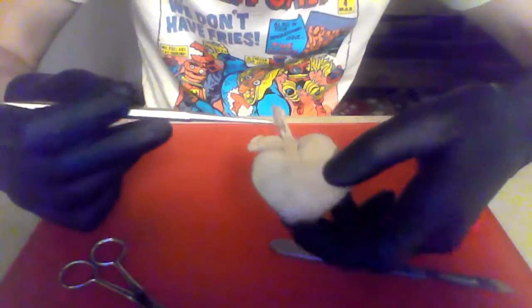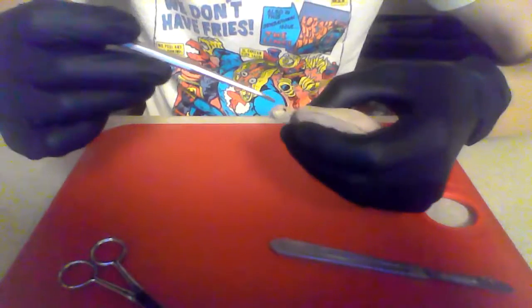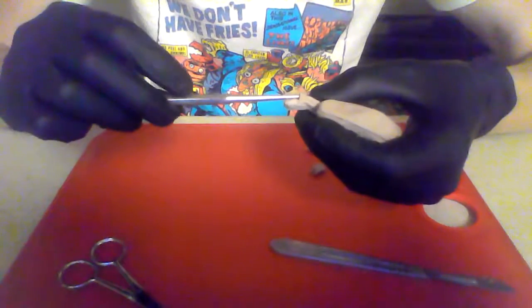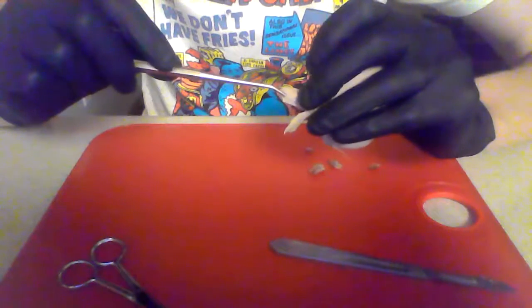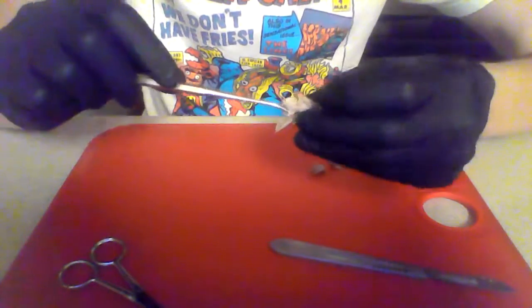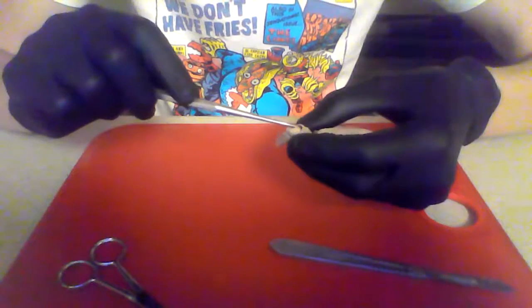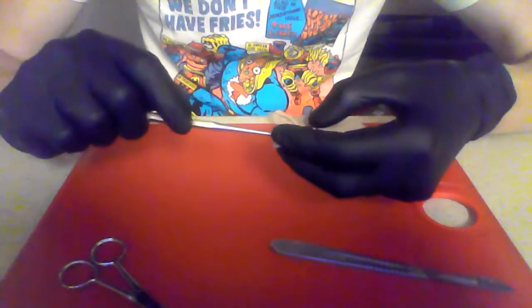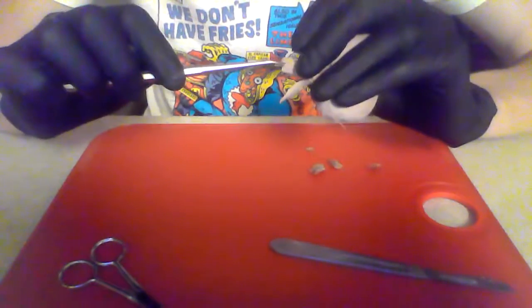Another structure is the hilus here, which has three structures branching out of it. I believe this one, the larger of the two, would be the renal vein, and the smaller one here would be the renal artery, and then we have here the ureter. The function of the renal vein is to carry deoxygenated, filtered blood from the kidney to the heart via the inferior vena cava.